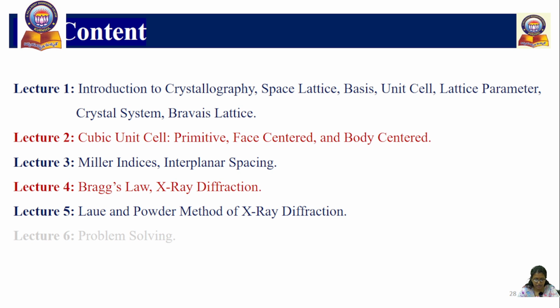Okay, so in the previous lecture we discussed Bragg's law and X-ray diffraction also. From X-ray diffraction we know why we use X-rays to study crystals: their wavelength and the spacing available between crystal planes are of comparable range. That's why X-rays can be used. Neither visible nor UV light can do this.